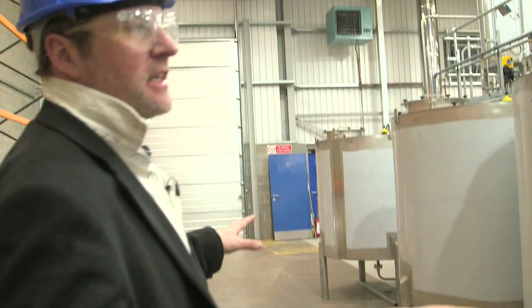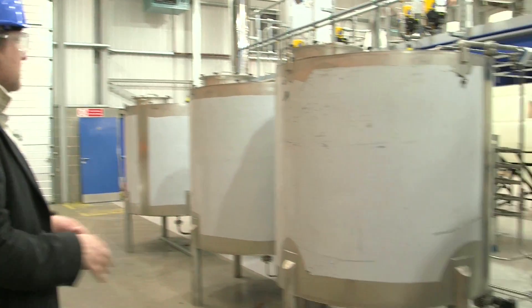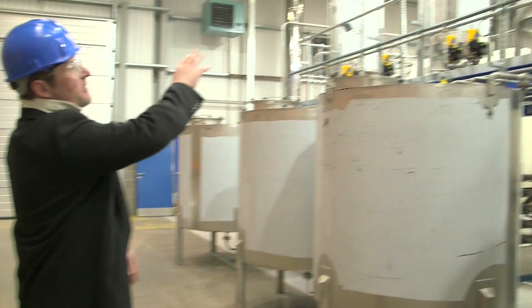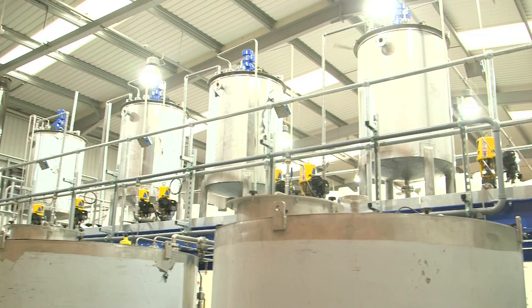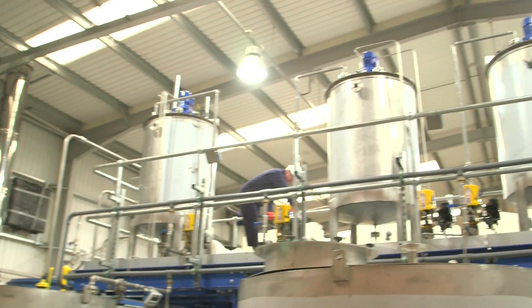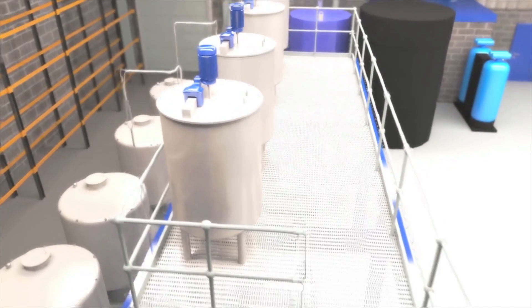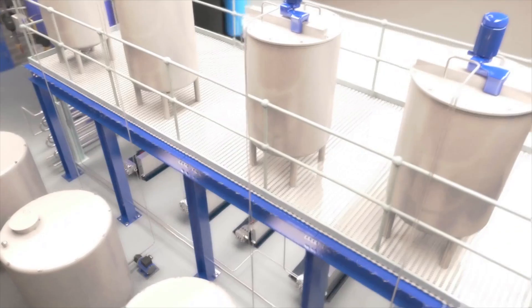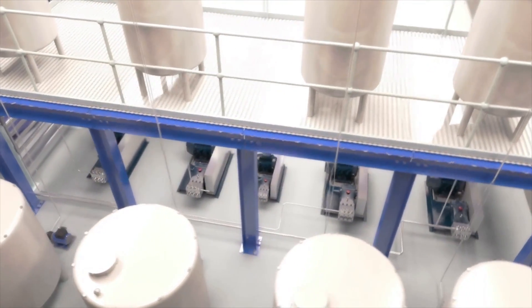These are holding tanks for our chemical precursors. They will go here and they get pumped up to the top, where they're diluted to the right concentration for the process. They have to be the right concentration, otherwise you make the wrong products. So we have complete control over the way that everything is mixed together to make the right precursor concentrations.